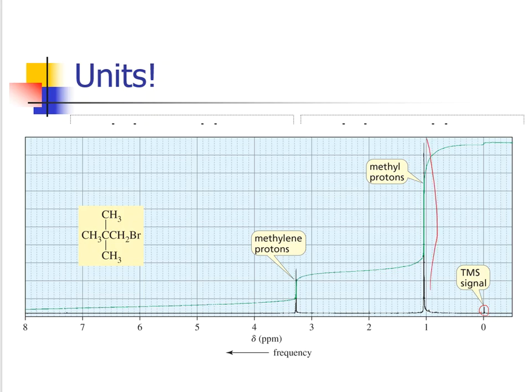So it looks like I have a chemical shift right here at around 1 part per million, and then it also looks like I have another chemical shift here, at about 3.4 or 3.3 parts per million, somewhere in there. And then it doesn't look like I'm seeing any other signals at all coming from this substance that we ran. Just 2 lines that shoot straight up, one at a little more than 1 and one at about 3.3-ish.